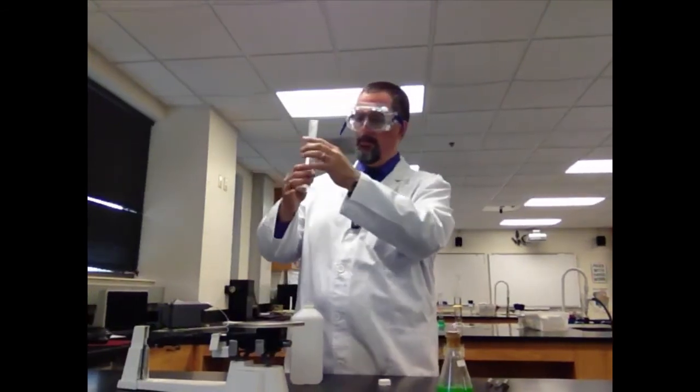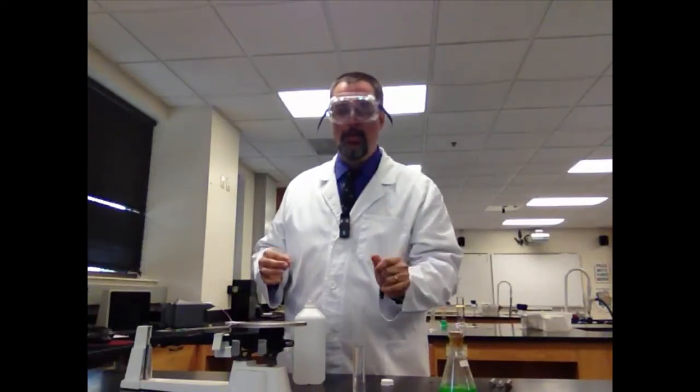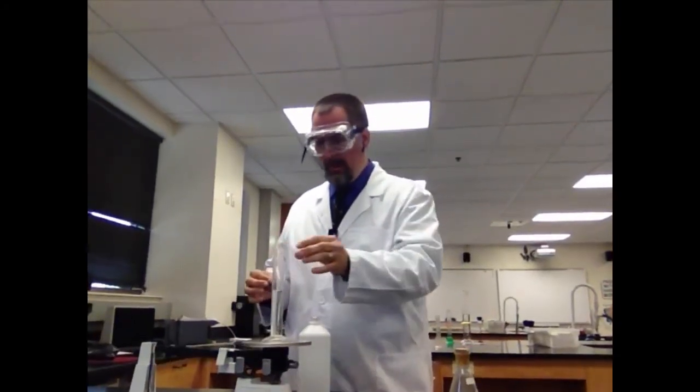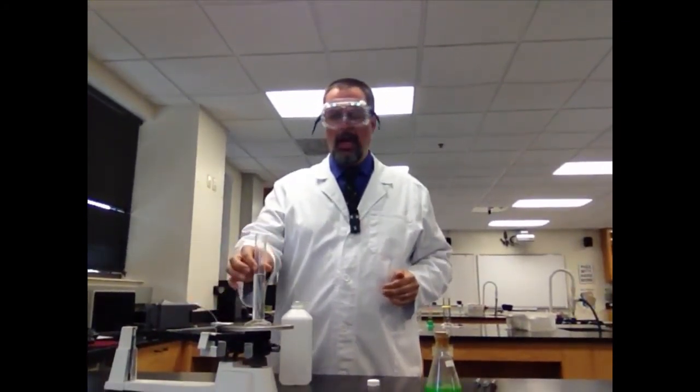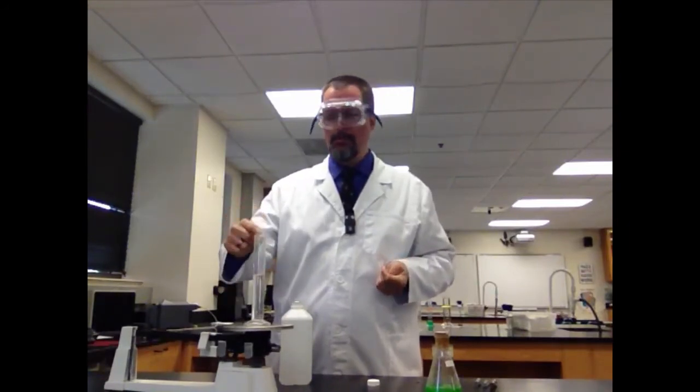You'll measure the volume. Remember to put this down on a flat surface so you can read the meniscus. Remember to use the uncertainty. Then you'll put it back on the balance, and you'll measure it again. So you had the mass of the empty cylinder. Now you have the mass of the cylinder with the liquid in it. Take the difference between those two, and that's the mass of just the liquid by itself.